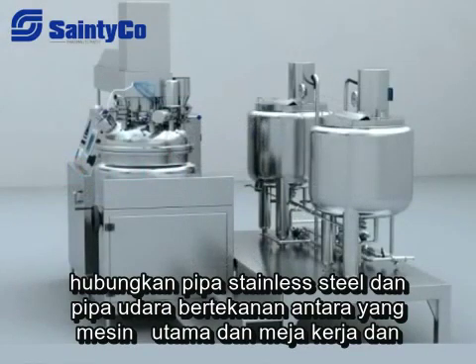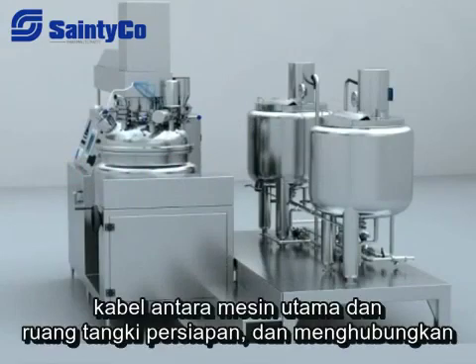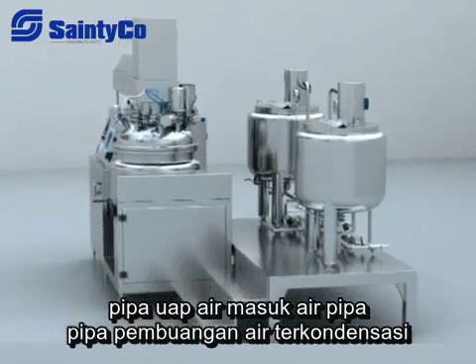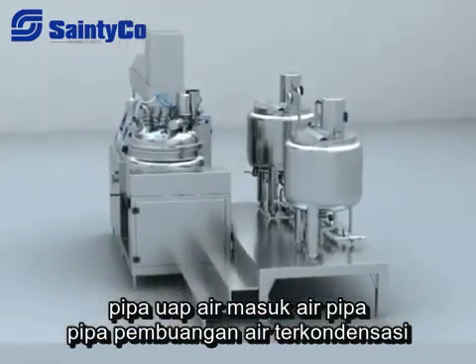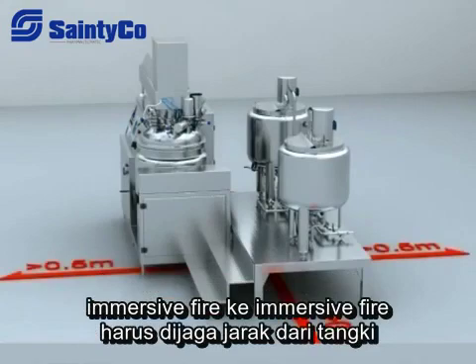Connect the stainless steel pipe and compressed air pipe between the main machine and the working table, and the wires between the main machine and the preparation tank room. Also connect the steam pipe, water inlet pipe, water discharge pipe, condensed water discharge pipe, and compressed air inlet pipe between the workshop and the emulsifier.